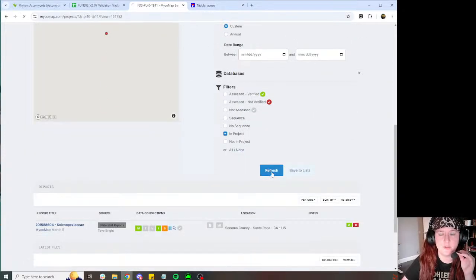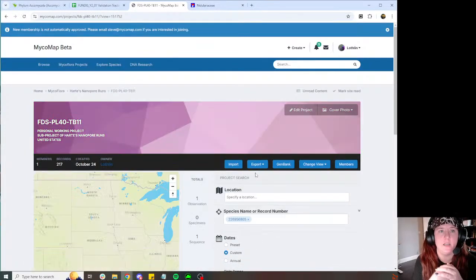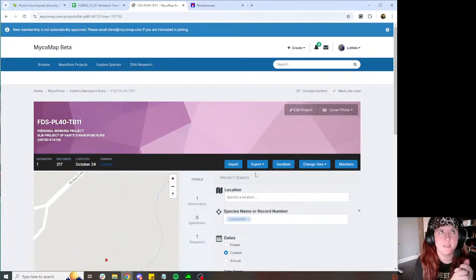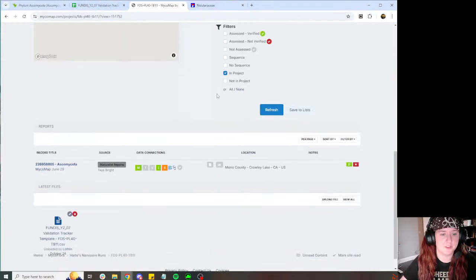Yeah, so we definitely do high throughput sequencing. I'm not going to say it's not as accurate as Sanger or Illumina or stuff, but, oh, I see what you mean. Yeah, our sequencer makes these spreadsheets. It's all on him. I don't actually make these spreadsheets.